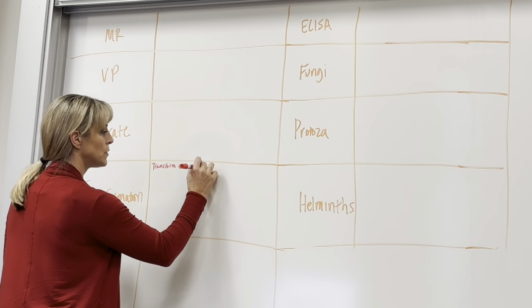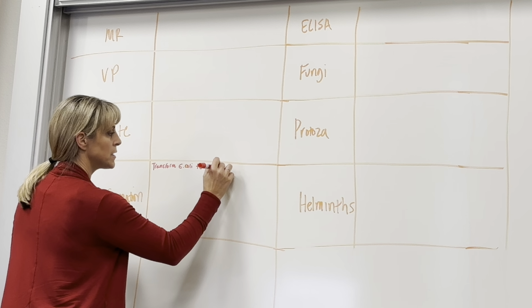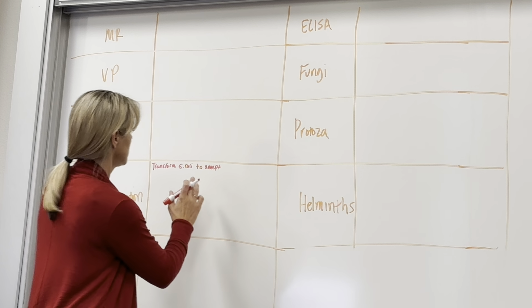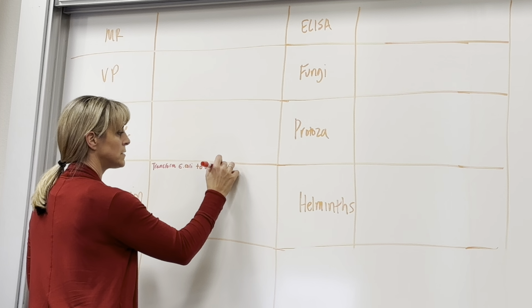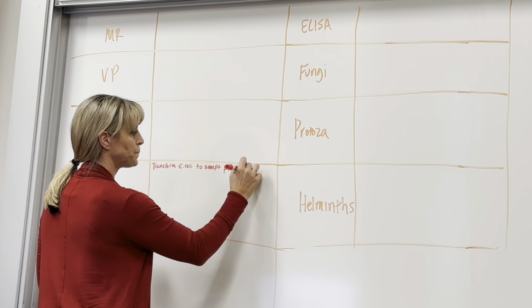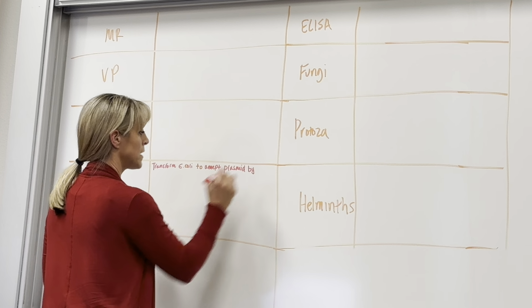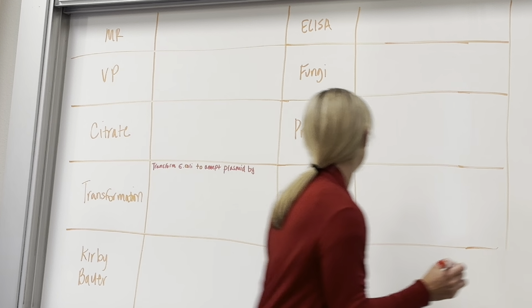To accept a plasmid by inducing competency. Actually, what I wanted to do is give you guys just one or two words. I'm being too wordy.